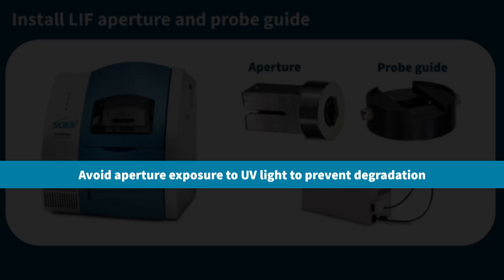Additionally, avoid aperture exposure to UV light because this can cause it to degrade.